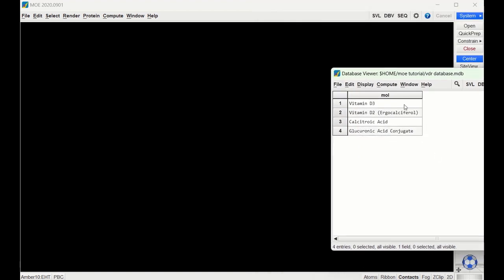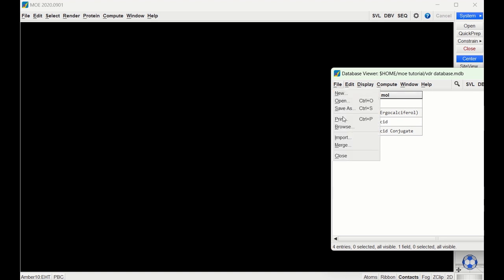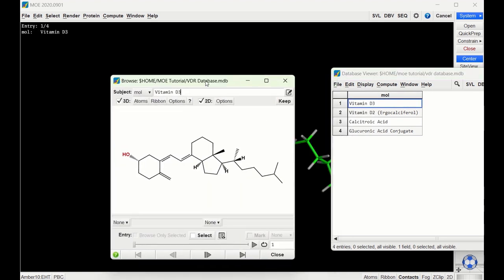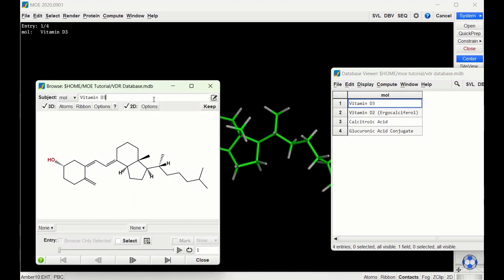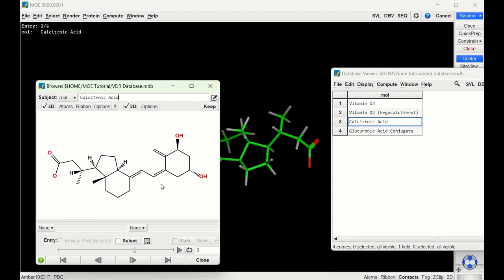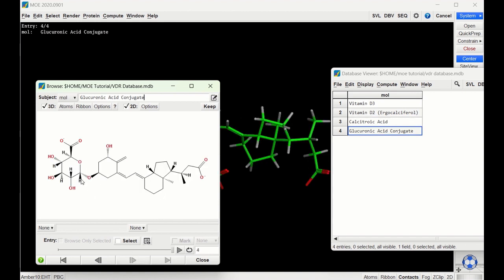Here we have the four ligands that we're going to be docking into the receptor. If we go to file and browse we can see what we're going to be docking. The first one is vitamin D3. We're also going to be docking vitamin D2, calstroic acid which is one of the final metabolites of vitamin D, and the glucuronic acid derivative of calstroic acid.